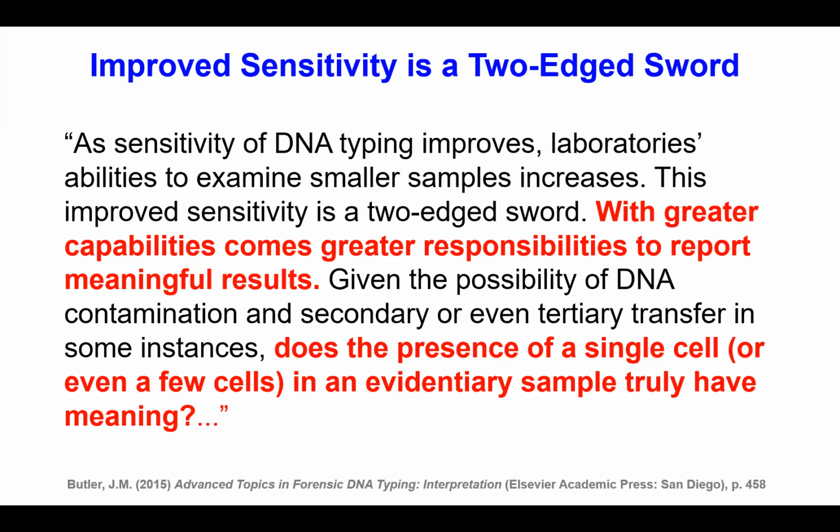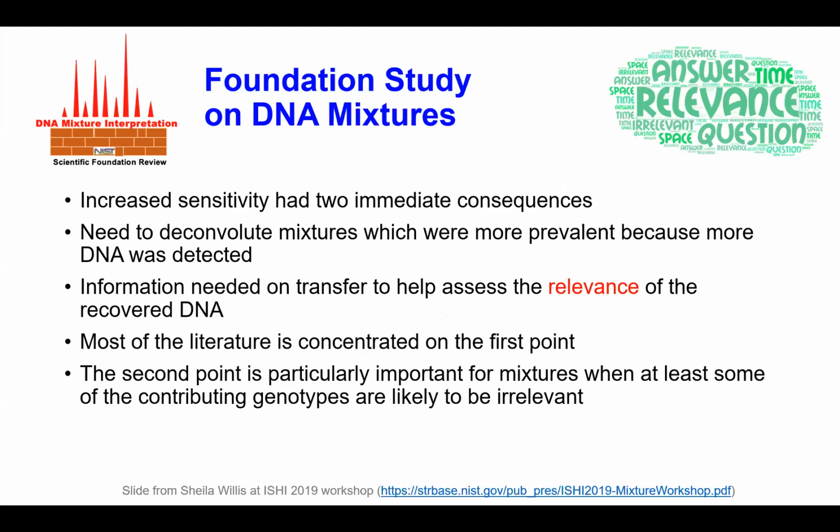In this foundation review, another aspect we're exploring is the relevance issue that relates to DNA transfer. This is a slide that Sheila Willis presented when we did this workshop at the International Symposium on Human Identification at the end of September. At the bottom of the slide, you have the link to it on STRBase. She gave about a 45-minute presentation on this issue, so you can go and see all of her slides. I just put two of her slides in here to illustrate some of the points.